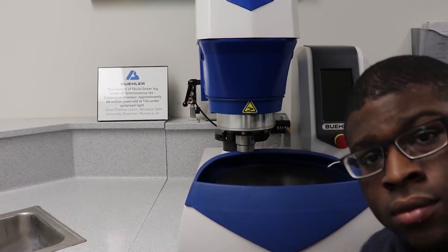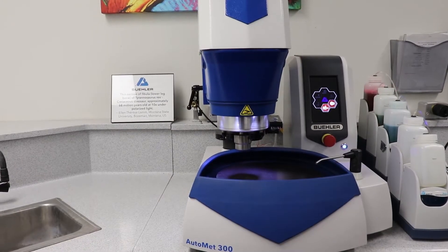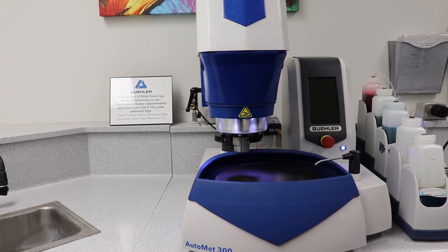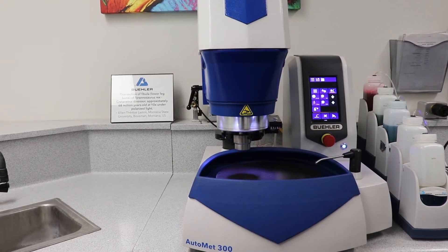This is Shindu Abazi. He is here to show the programmability of Buehler's AutoMet Pro Grinder Polisher. The programmability of the Pro Models helps ensure reproducible results, ideal for customers in demanding environments needing to process a high volume of samples.